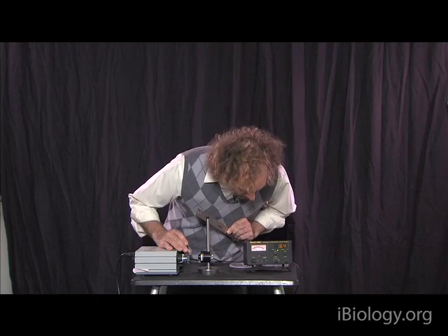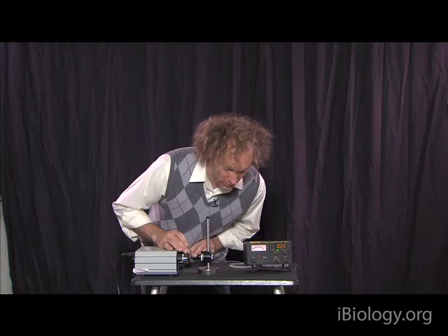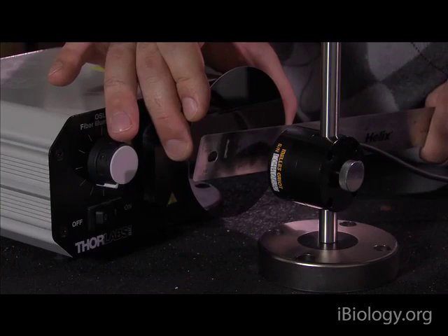So let's add a piece of metal. This is just a metal ruler. And let's stick this also in the path of the detector. Now it goes to zero. So we didn't turn off the room lights. All I did was add one more thing blocking the path of the light.